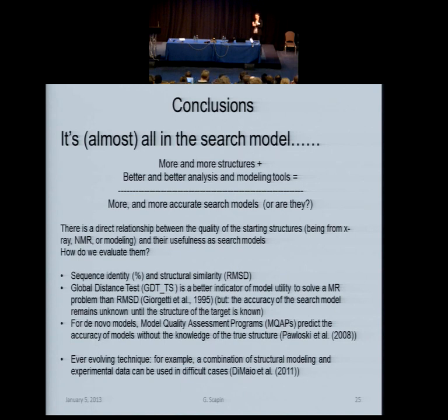And a good model is not just a model that is closer to my final result, but it's also a model that is accurate. And so I think that we as crystallographers, but also NMR people and modeling persons, should be doing everything in our possibility to make the structure that we deposit the best structure possible. Every refinement program comes with a lot of these structural validation tools, and we should use them a lot, because my structure will be used by somebody else to phase their own data. And I want to make sure that I give to my fellow crystallographers my best model possible.